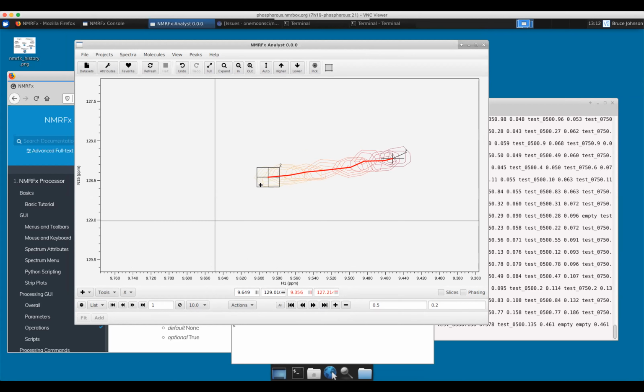By default it shows the first peak and the last peak; the first peak is shown with a box and the last peak with this cross, so you can distinguish them, and you can step through peaks and show all peaks. You can't right now turn on all the peaks individually, but you can step through them. So this is in some ways better, in some ways doesn't have that.